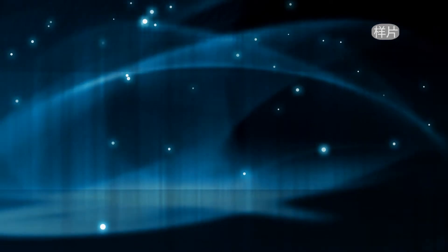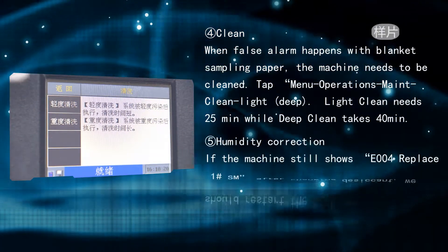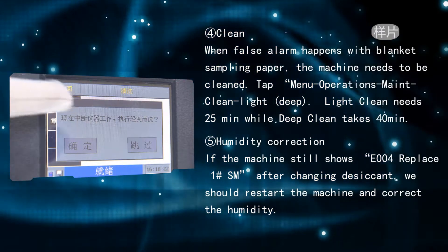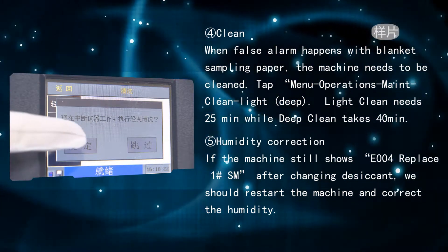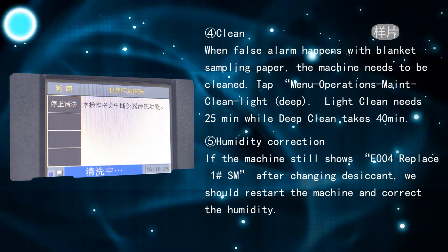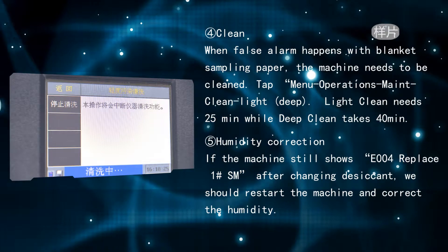Clean: when a false alarm occurs with blank sampling paper, the machine needs to be cleaned. Tap Menu, Operations, Maintenance, then choose Clean — either Light or Deep. Light clean takes 25 minutes while deep clean takes 40 minutes.